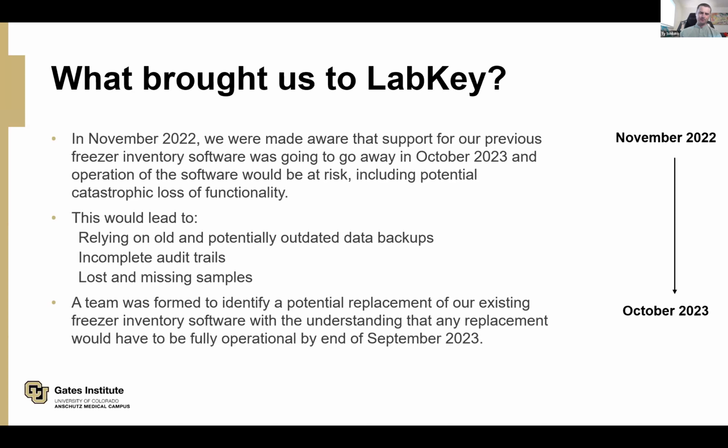In November 2022, we were made aware that this freezer inventory software was going to lose its support and that we would be operating that software at risk, meaning we could potentially completely lose the software. We would have to rely on old and potentially outdated data backups.